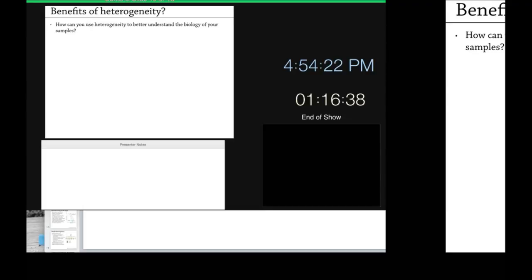Any ideas? Do you have any examples from your previous work, Ed? I know you worked with some pretty flexible molecules at one point. Very flexible, but there's kinetics, basically. Different ligands will shift things to different states. That can be meaningful, especially when you have a lot of different libraries of ligands, because you can have multiple conformations. Not all of them are active, and some of them are very important for activation.